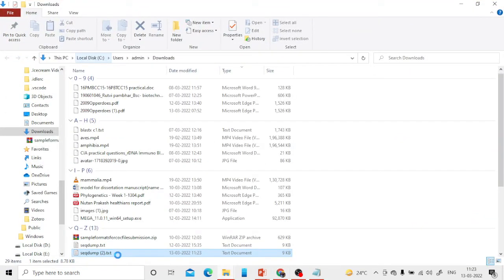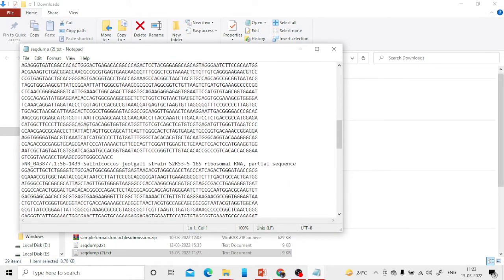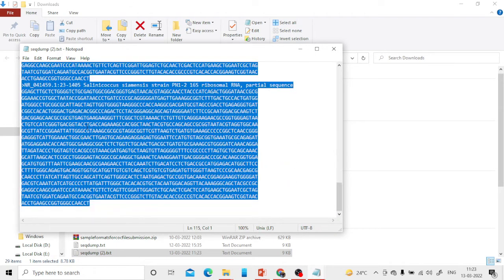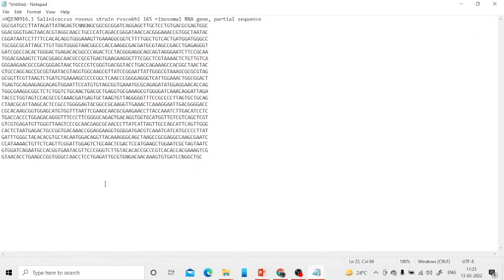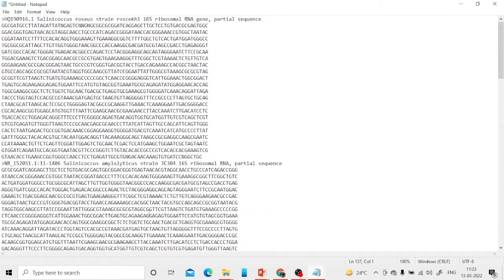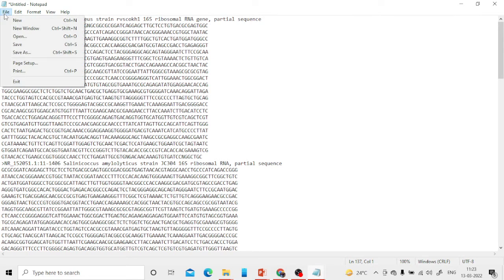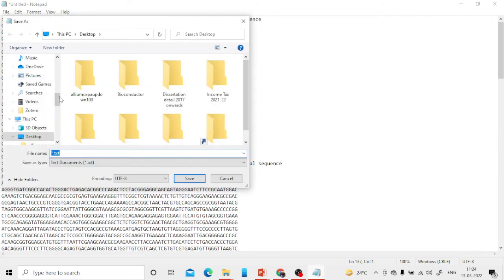Six sequences in FASTA format have been downloaded. I'll copy and paste them into the Notepad file where I already have my sequence of interest. Please be careful here — pause the video and perform along with me. Now click Save As on the desktop.